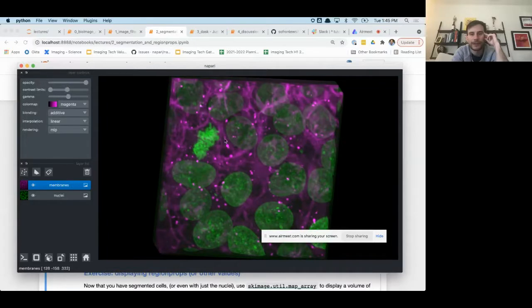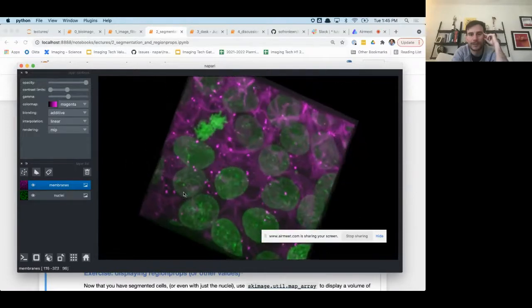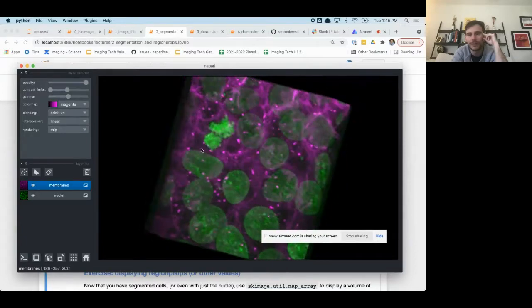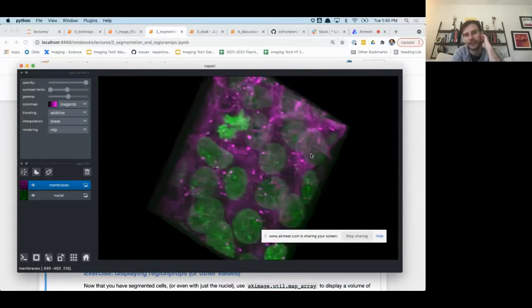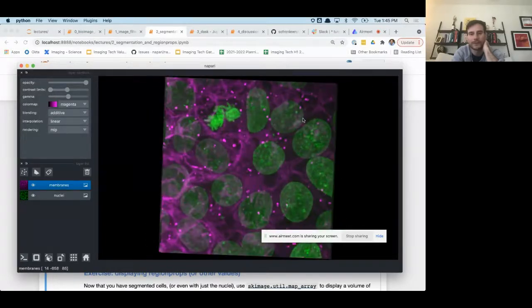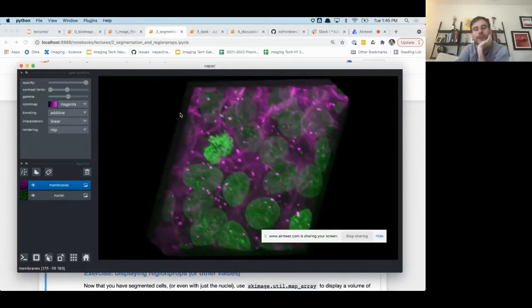You can now see it's a much more challenging segmentation problem to attempt to get the full cell boundaries of the cells. And actually, we're not going to try that right now together. But this is just another example of looking at data together, and something that folks may want to spend some more time on their own after these tutorials. Doing more could be a great thing for them to try.